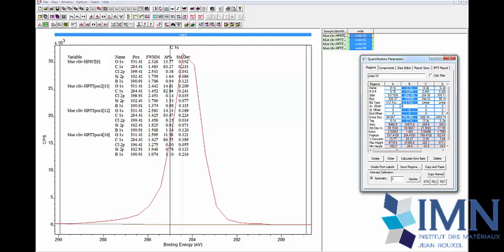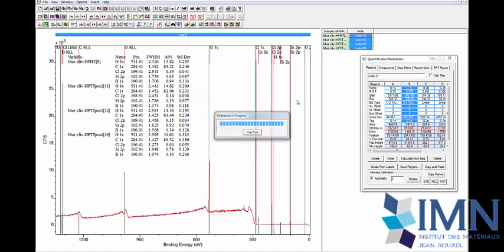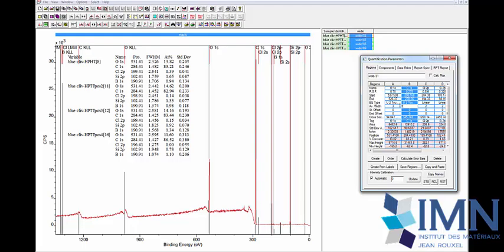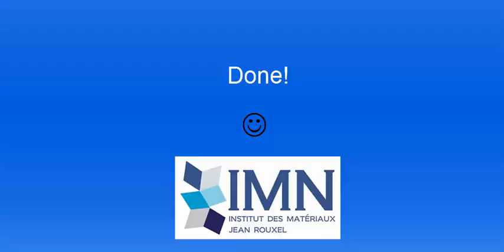Of course, sometimes it's not necessary. If you try to improve it for carbon, the intensity is so high that you don't need to have too many points left and right to have a good knowledge. It will not give you any improvement. But uncertainty is also a very good way to try to extract more reliable information from your data.